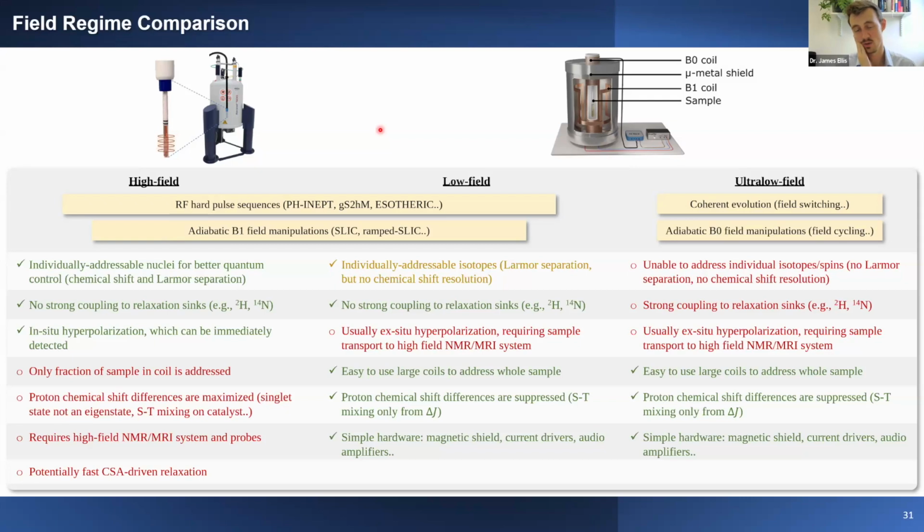They basically work by measuring essentially electron spins. So they typically saturate at something like a few hundred nanotesla. I guess you can go up to maybe a couple of microtesla in some cases with a home-built magnetometer. But you can basically see the problem: at a microtesla field, your electron spins are precessing very fast, and you can no longer really polarize them with the laser. So just based on how those magnetometers operate, they typically saturate at microtesla fields.